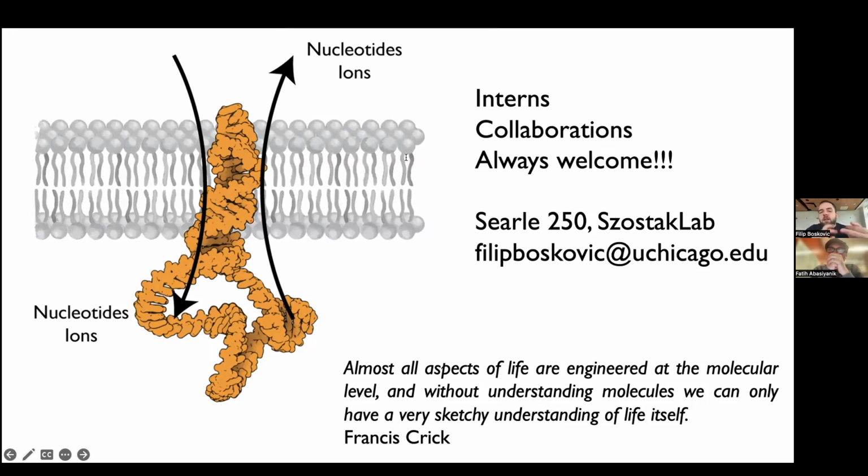Or you say, okay, I only care about ultra long DNA. Let's say you care about 1 megabase. You can say until you reach this amount of 1 megabase molecules. In terms of adaptive sampling, there's a tick box that you just press with your finger, and it will use your reference sequence for adaptive sampling. There are some new advancements that are not integrated in the device itself, but you don't need any special computer. It's done before you start your sequencing. You choose adaptive sampling as an option. You don't do it after. It's not a data analysis process.